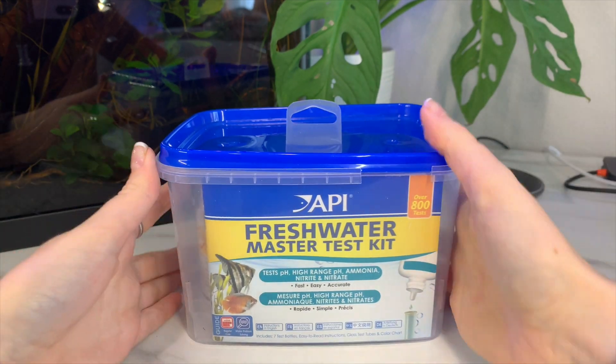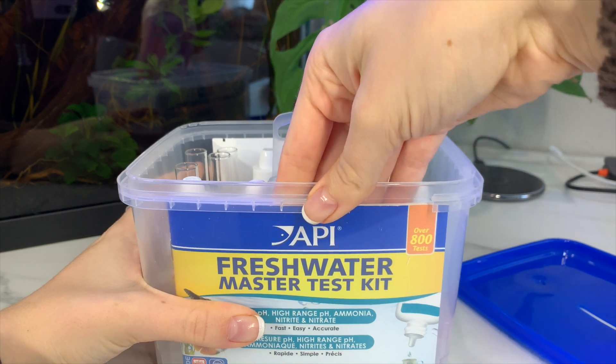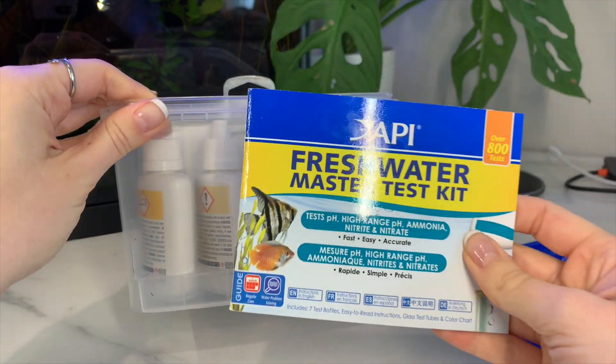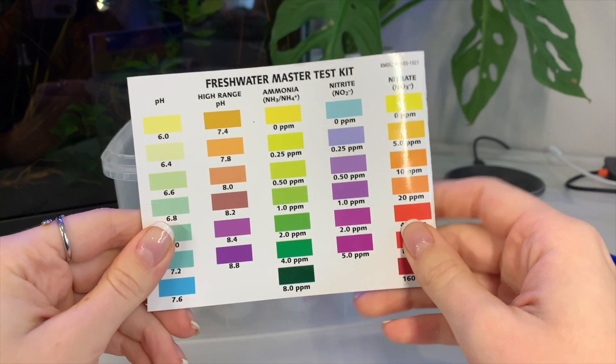You being here and watching this video is going to help you avoid all of that, so let's just go ahead and hop right in. Here is the test kit in all of its glory. As soon as you pop the lid off, grab the instructions. Don't throw it away after reading it because not only is it the cover for your test kit, on the back this is your chart.